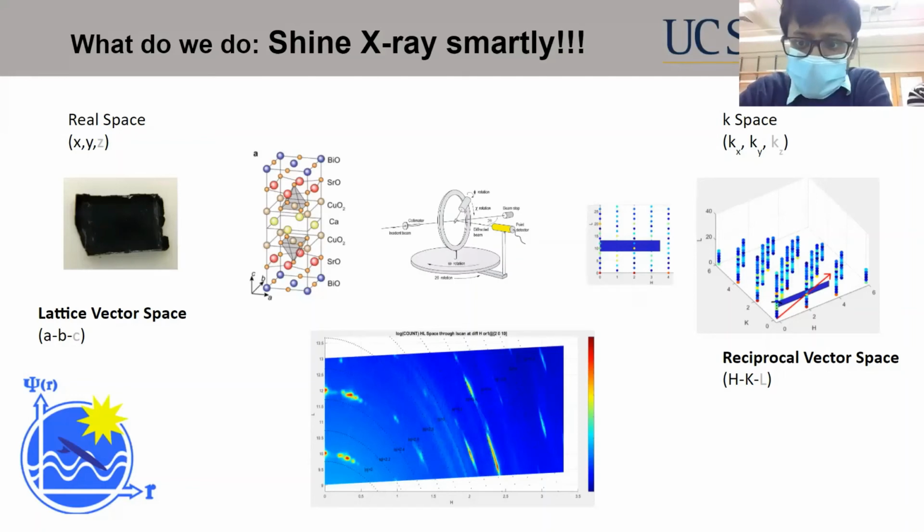Okay, so yeah, this is what I do every day. I take samples from Ishtadi or samples from Maya, who grows single crystals. I haven't touched a lot on single crystals because I don't have any understanding of how to grow them. It's a very complex procedure. Maya knows best in our group. Alejandro knew. I'm going to do the cartoon call at the end, but they are the masters of single crystal growth.